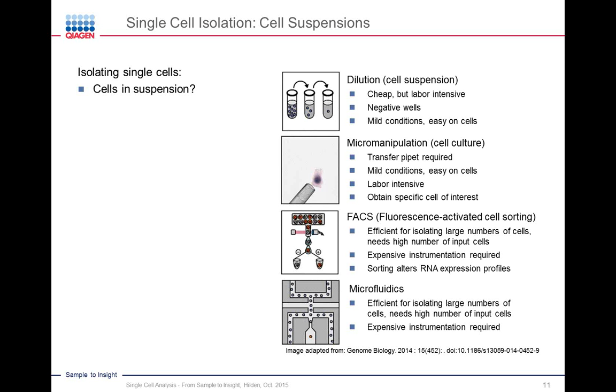You can visually identify it. You can take pictures of it. You can stain it beforehand. And in the case where maybe this cell is something that's very hard to identify visually, that image recognition software can't help with, this is potentially a good option for you.